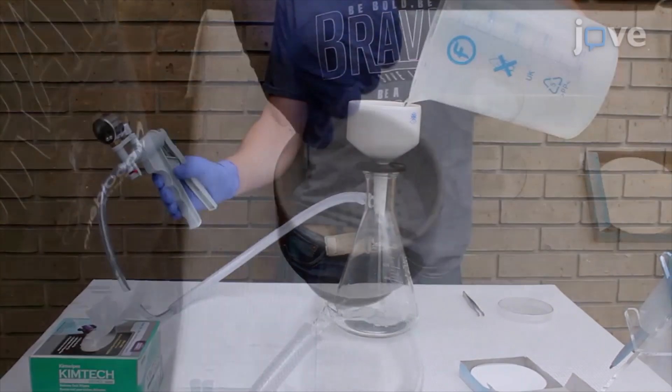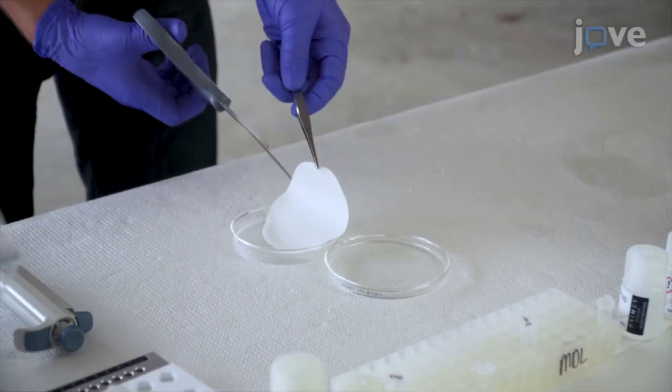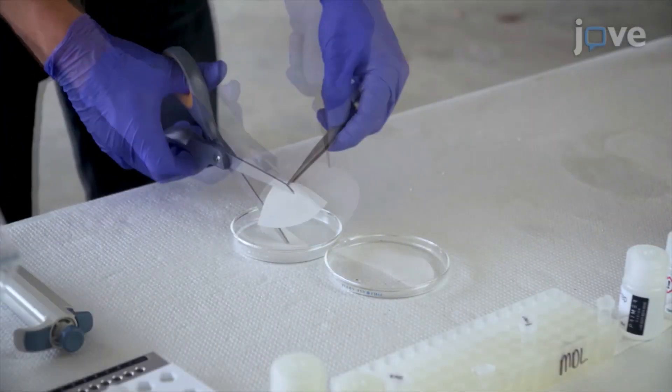When all of the water has been filtered, use forceps to remove the filter paper from the funnel and use sterile scissors to cut the paper into small pieces.